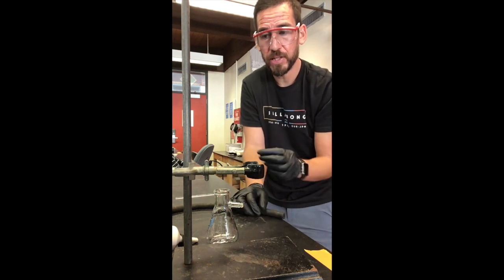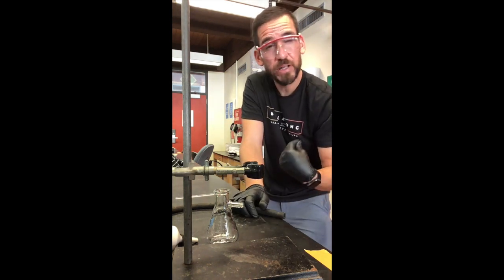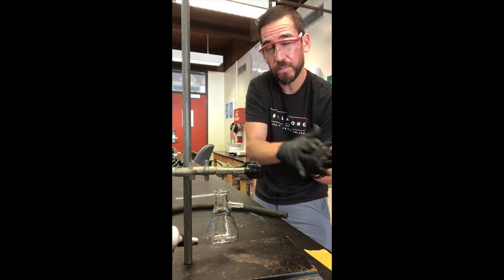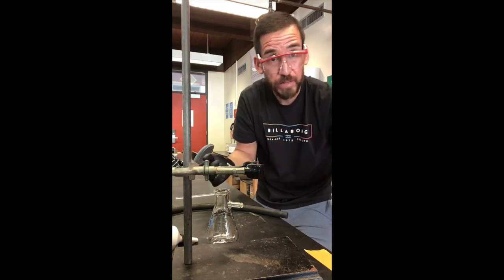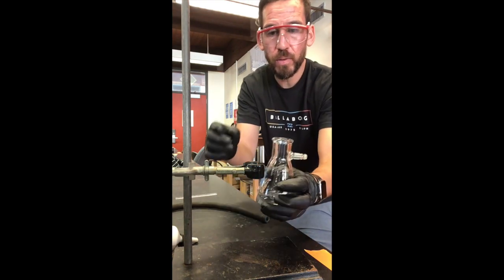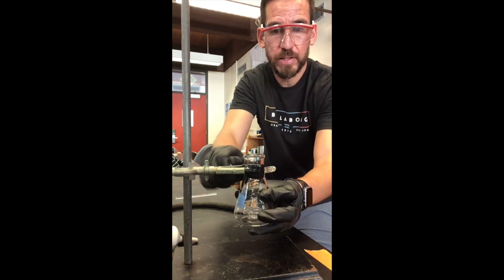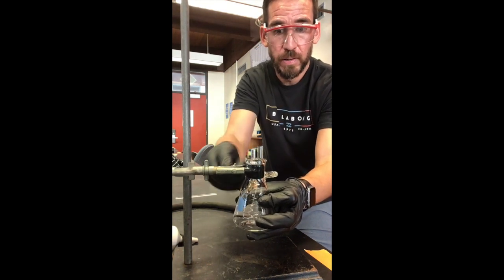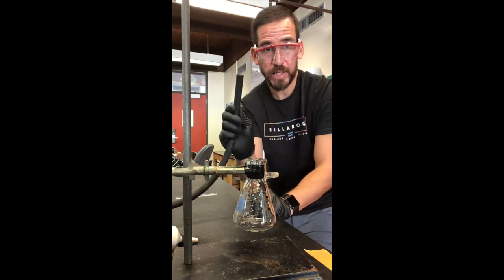Imagine, like sometimes when you're sucking through a straw and you have this delicious milkshake plugging the bottom, and the straw goes like that. That wouldn't be a very good vacuum tube, right? So what we're going to do is put this on here. We're going to clamp it so that it's secure and will not fall over, and we want to do this before we connect the vacuum.